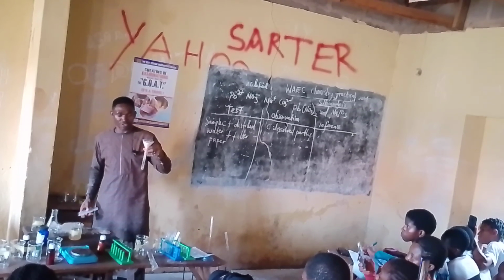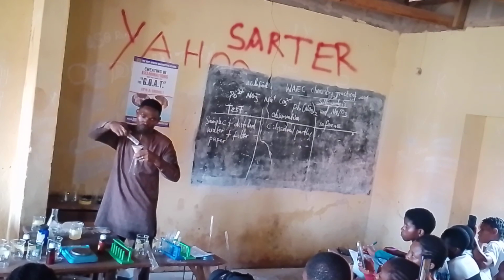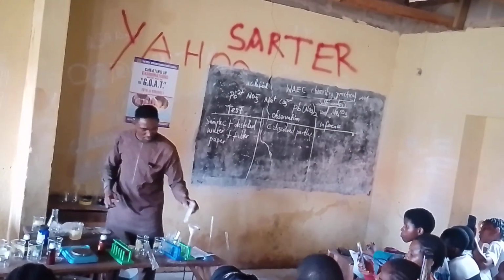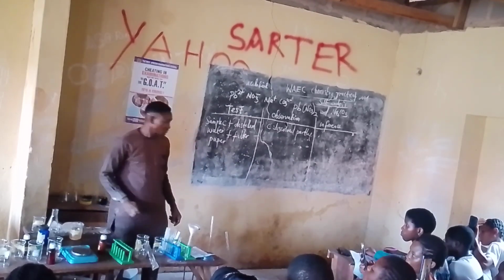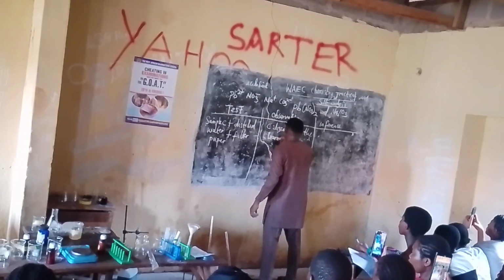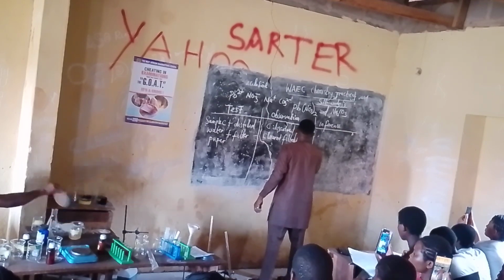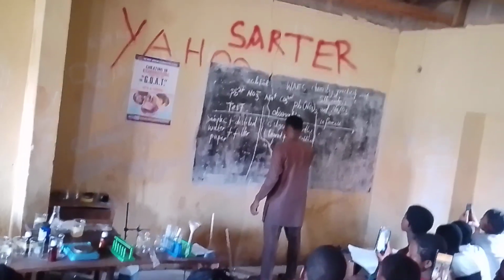Yes, it's going to be dropping gradually. So we're going to have a clear filtrate. And we're also going to have residue. You write clear filtrate and residue.